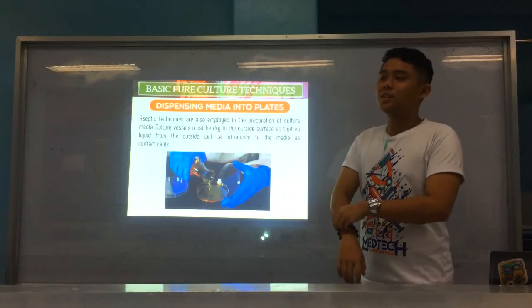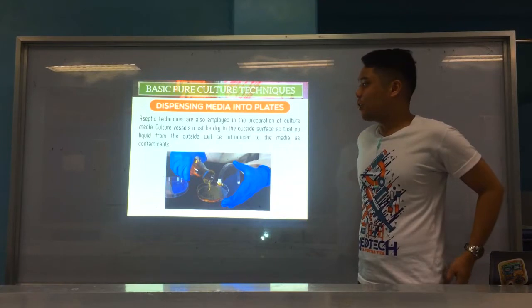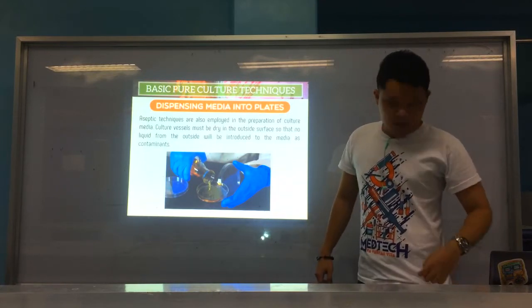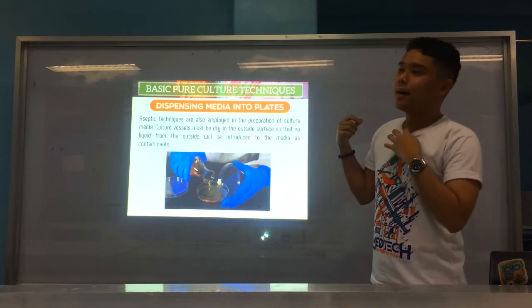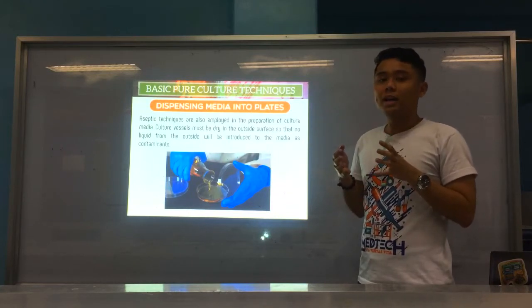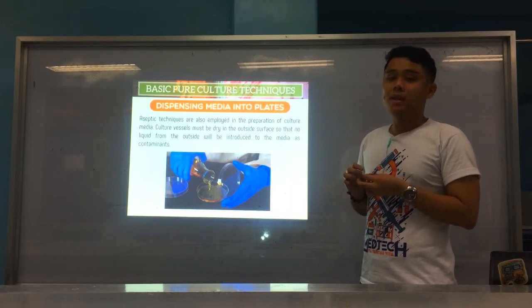Okay, alright, so this is now the second part of the video of pure culture techniques. Now we go to dispensing media into plates. In your culture media preparation, we had a video on that. It's really important that when we dispense culture media into plates, we limit and avoid, as much as possible, the introduction of contaminants to these culture media.